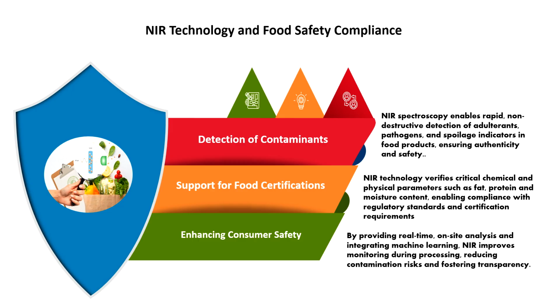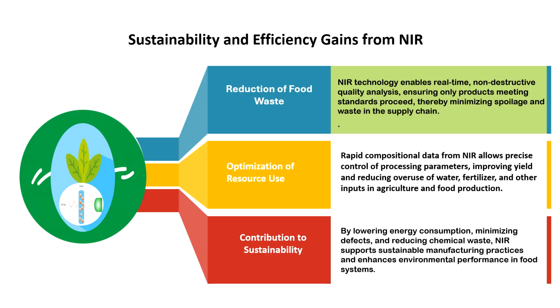This technology also helps in enhancing consumer safety by providing real-time on-site analysis and integrating machine learning. NIR improves monitoring during processing, reducing contamination risks and fostering transparency. Sustainability and efficiency gains from NIR.